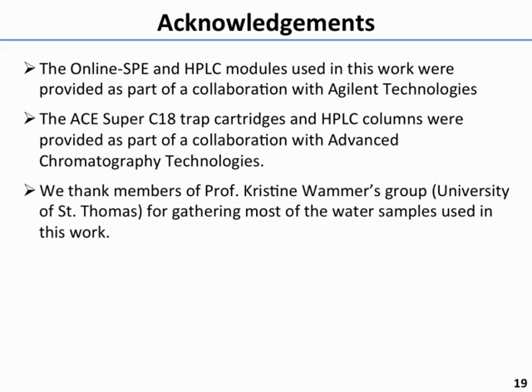Have you tried different kinds of stationary phases on your SPE, and what results did you get if you did? No, but we've had quite a lot of conversation about that, and that's job one once I get home. Because it's not optimized at all. I think we've looked a little bit at the effect, doing an experiment where we vary the injection volume and look at the linearity of response, and I think we're probably losing some or all of these compounds, so we really need to focus on optimizing the chemistry. This is just a starting point, basically.